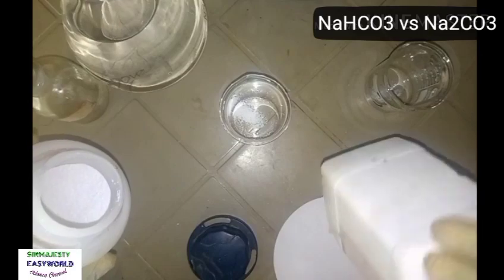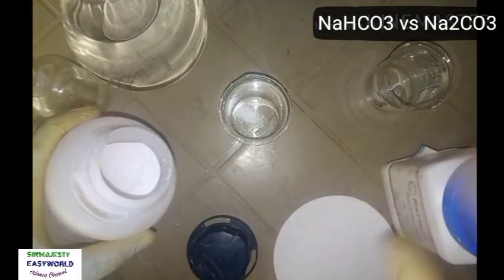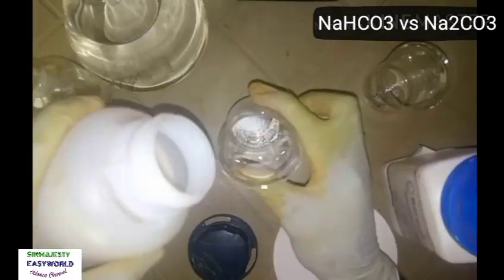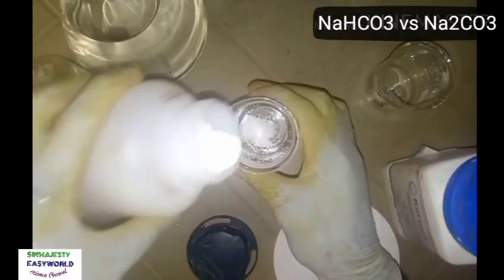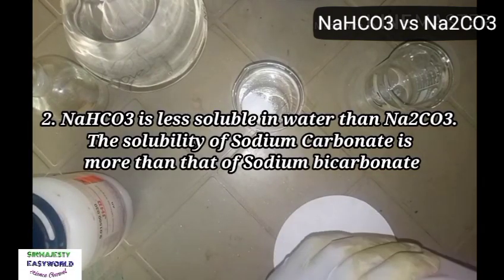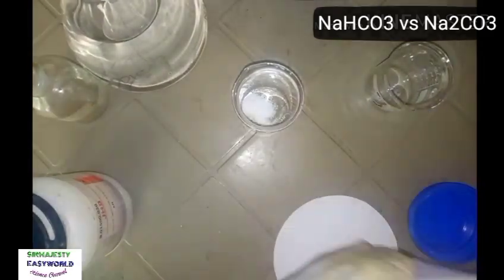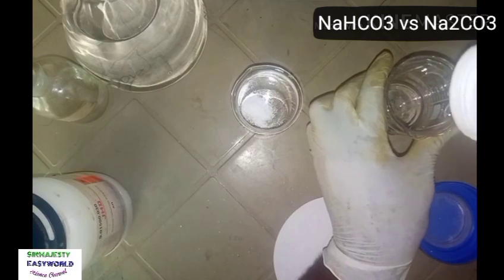This one should be called baking soda, of course, because it's used in baking powder. But it's an acid salt, while this one here is a normal salt. So I want us to see the differences between the two. The two dissolve in water, of course. Both are highly soluble, but the carbonate is more soluble than the bicarbonate. So here, you see they are all white in appearance.